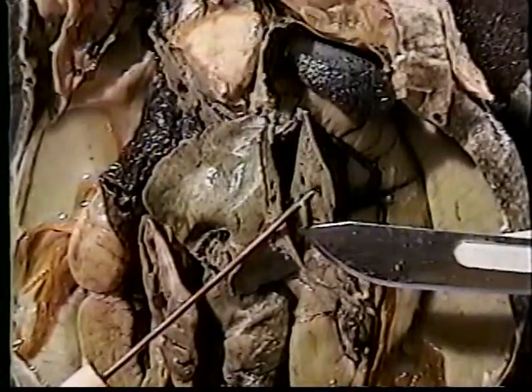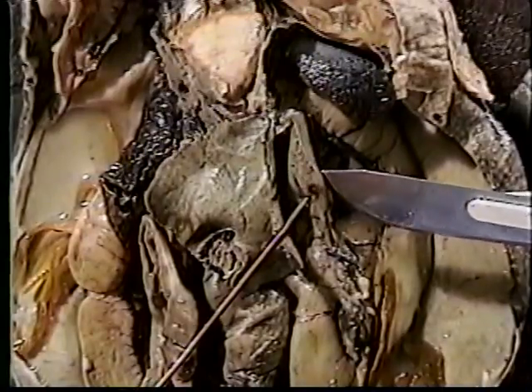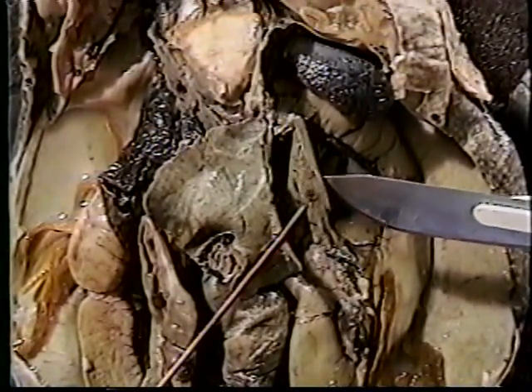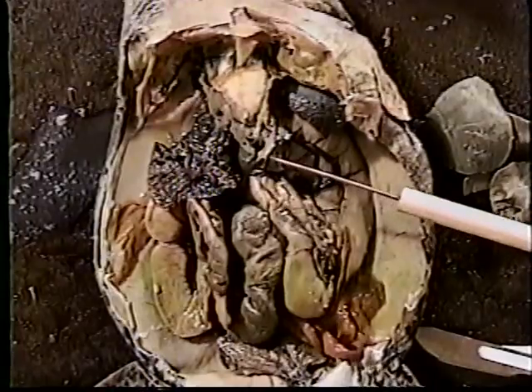As you can see, it looks very similar to the exterior area of the liver organ, yet we find very fine, small passageways within the liver. Now that we've eliminated the liver, the gallbladder comes into clear view.